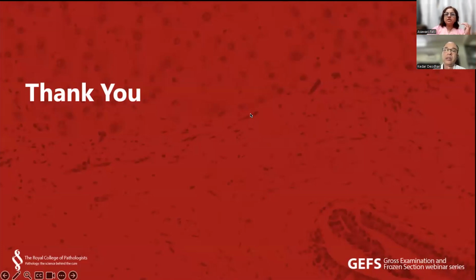So it's up to you, but you have to clearly give the message to the surgeon that ideally what we do is review the biopsy. We take the size of the tumor in the biopsy, which may not be the right one, but average size, because these are small tumors. But definitely these are T1 tumors. So if it is in the biopsy and it is not there afterwards, that means it's usually a T1 tumor. Give whatever size is in the biopsy.